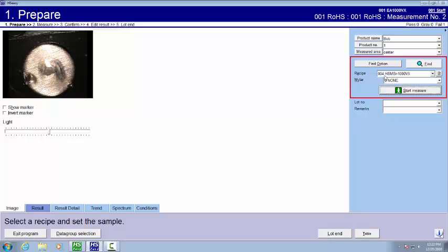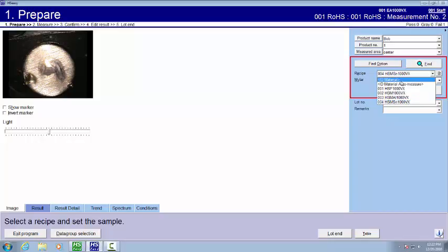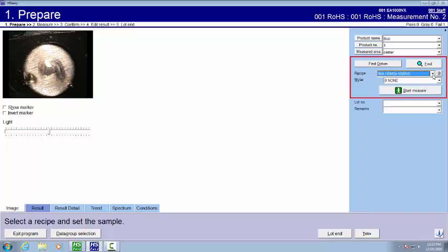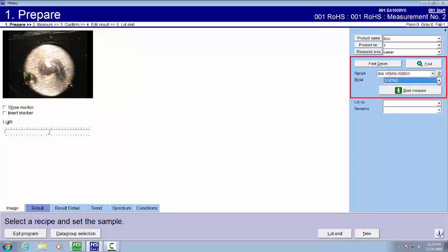This is a high speed metals tin sample. There's a list of them here that you can choose and we can add more. We're not using any mylar to protect underneath the sample. We can do that if we want to, but I don't have any in there right now.